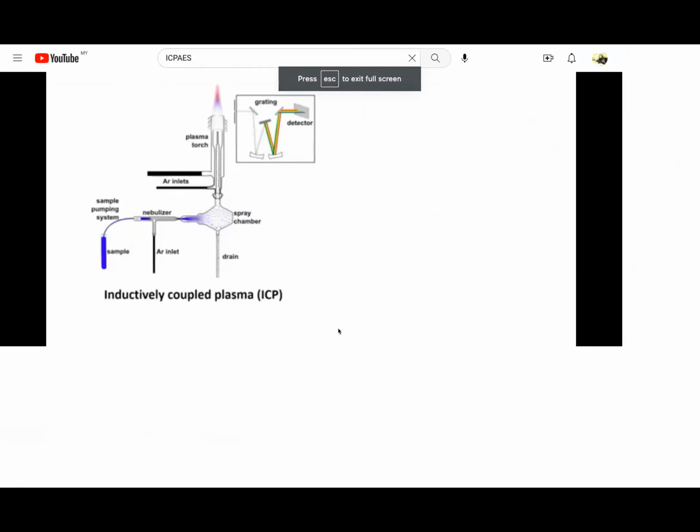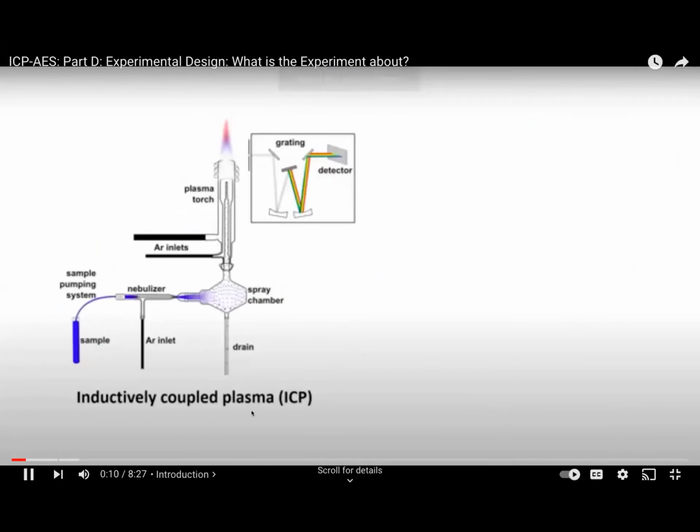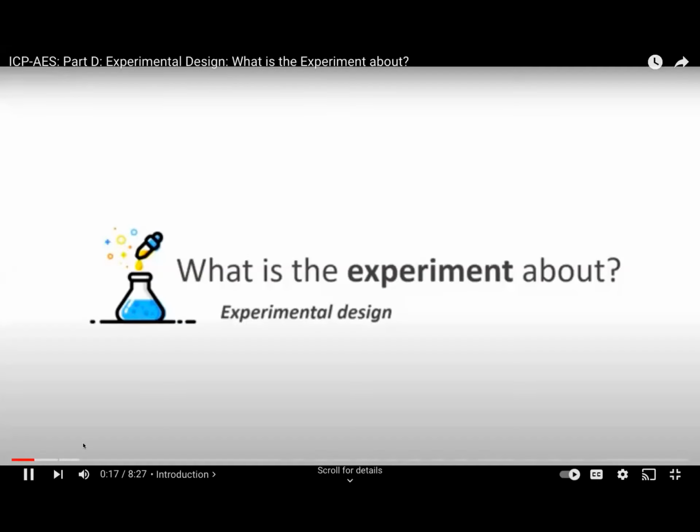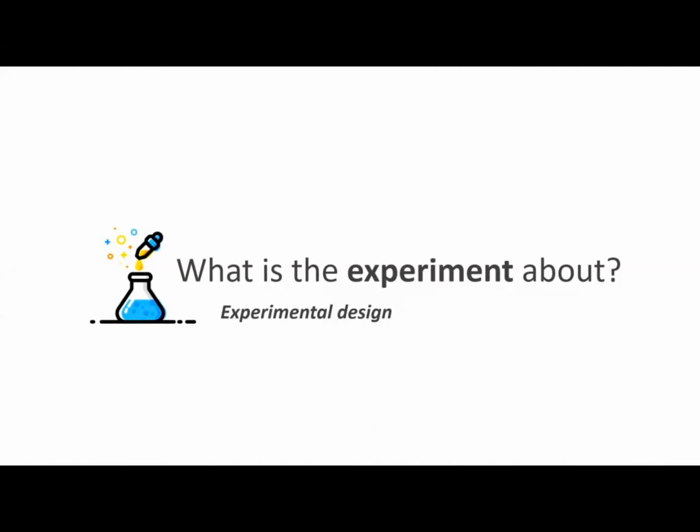5 minutes more. Hey guys, welcome back. In the previous videos, we have learned how ICP and AES work. The next question will be, what is this experiment about? In this video, we will take a closer look at the experimental design.